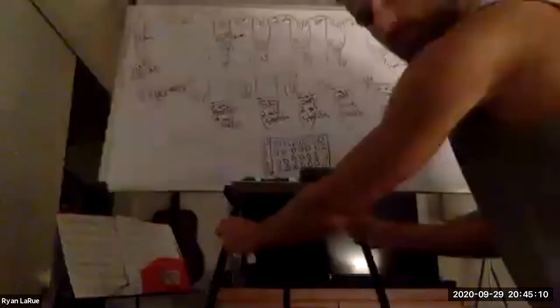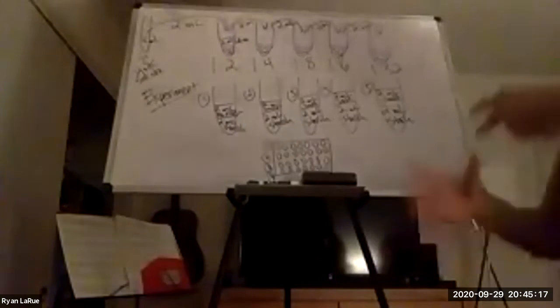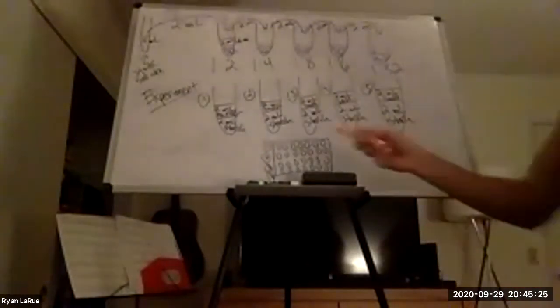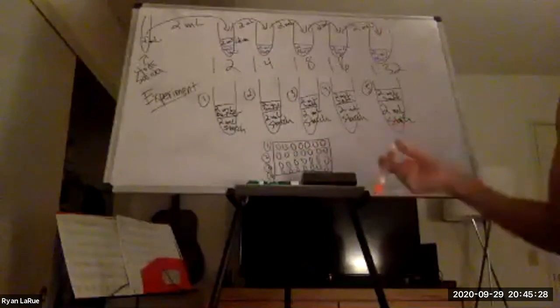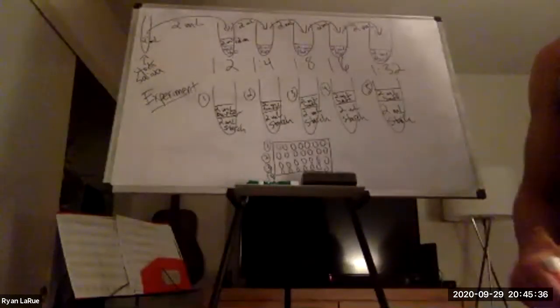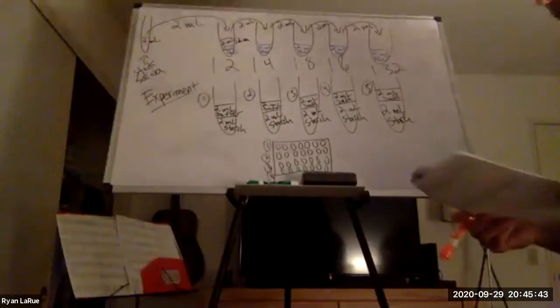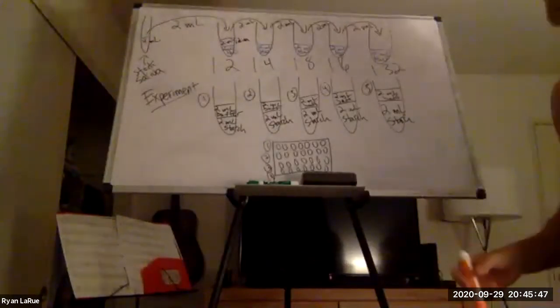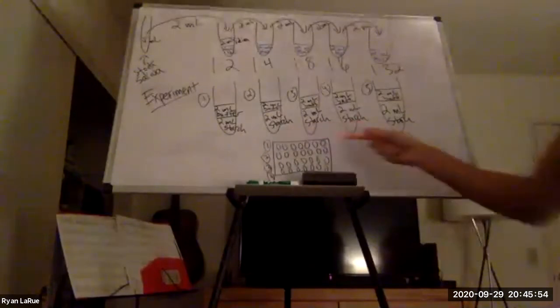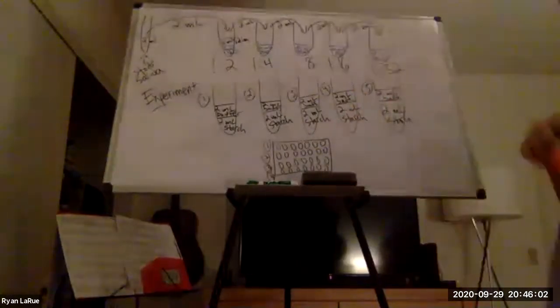The next thing I want to do, we're kind of priming everything. We're setting it all up for this reaction. It's important because in this experiment, timing is a thing. But the next thing we're going to do is in each one of these wells, I'm going to add a reagent that should sound familiar from last week's lab. And it's going to be Lugol's solution. Now, oh my, okay. I just read in the lab. So it's 12, 12 wells per row. There's 12 of these. So 12 times something is 96 and that's how many go down. No, I don't teach math. So it's cool.